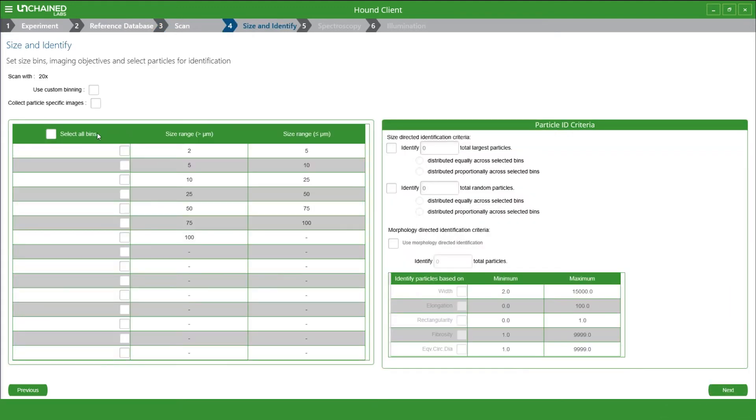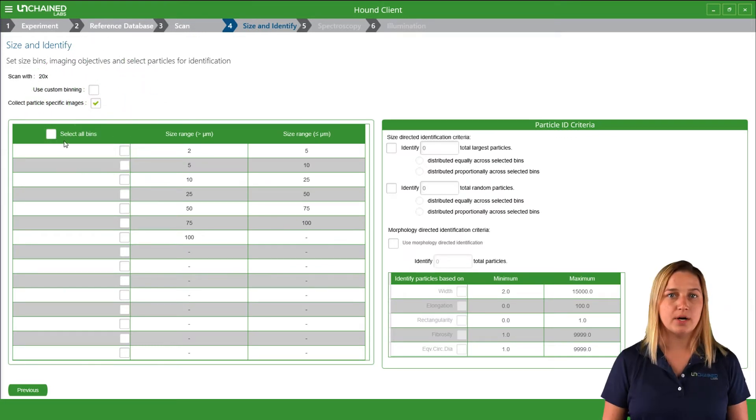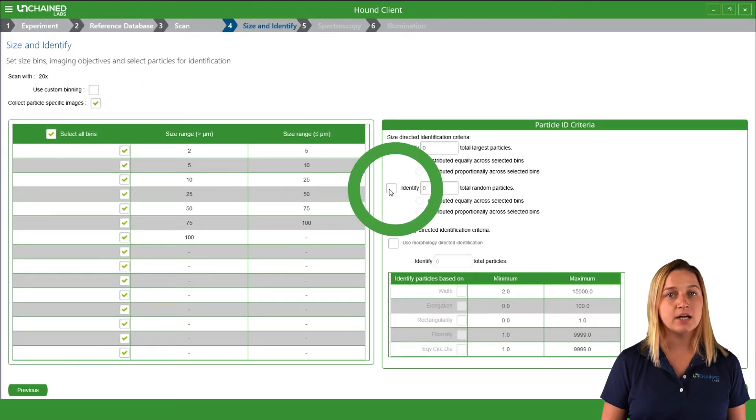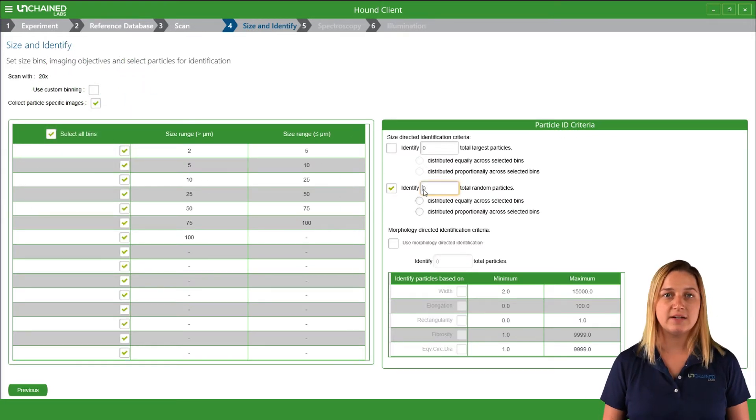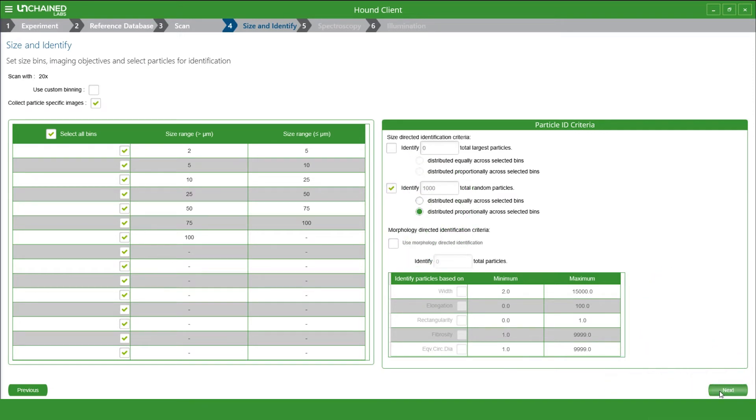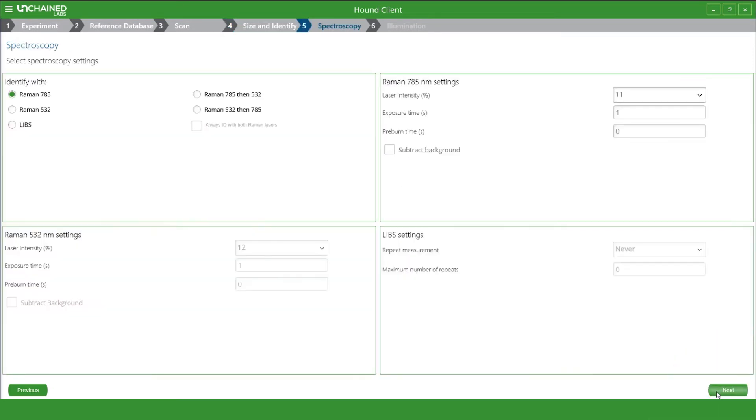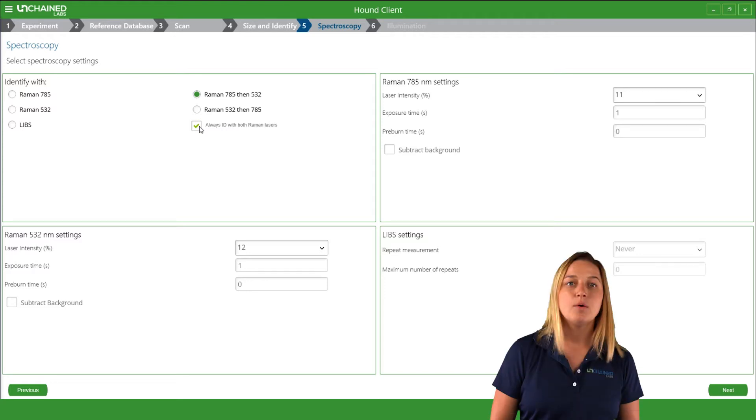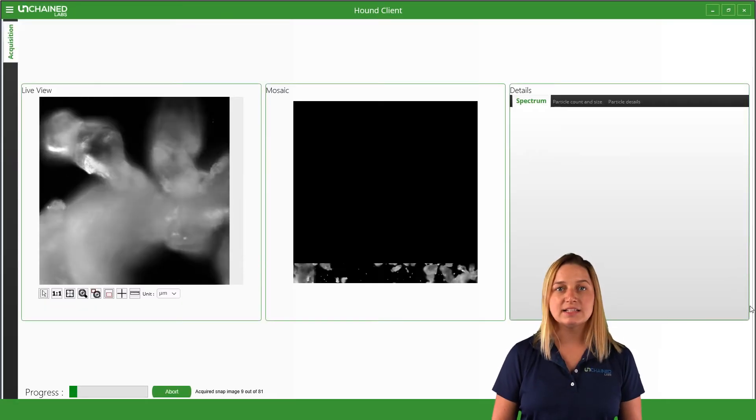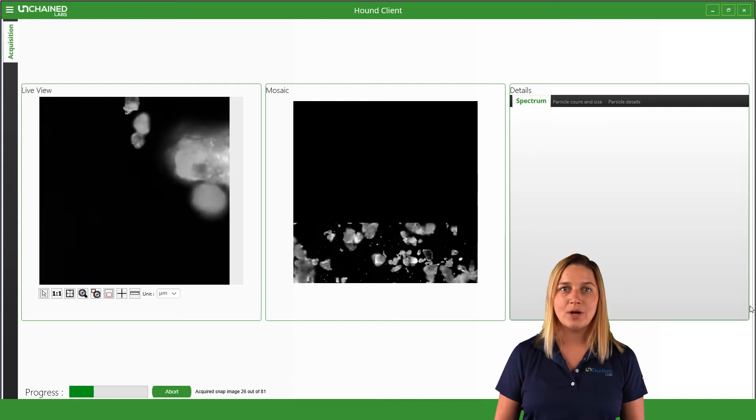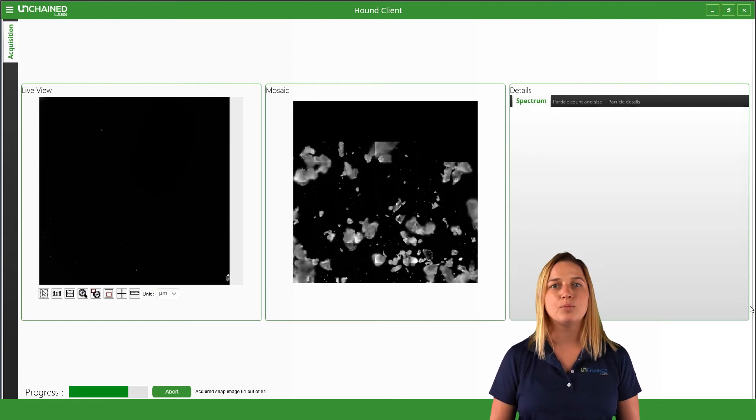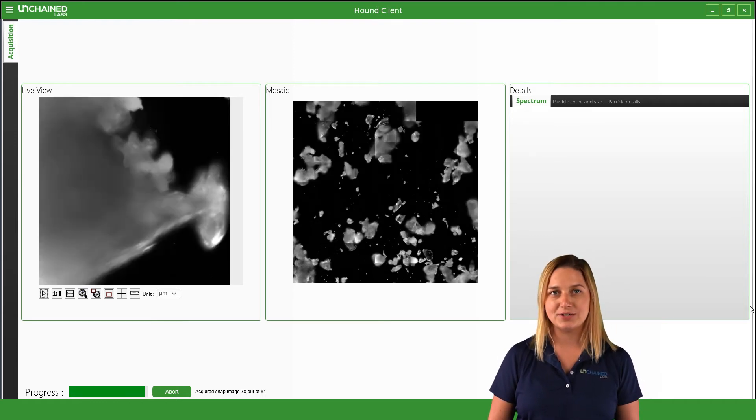I let Hound know what particles to identify. Here I'm going to identify 1,000 particles for a representative sample. I want Hound to use both the red 785 nanometer Raman laser and the green 532 nanometer Raman laser for each particle. Once I press start, I can get some work done while Hound identifies exactly what's coming out of this salt grinder.